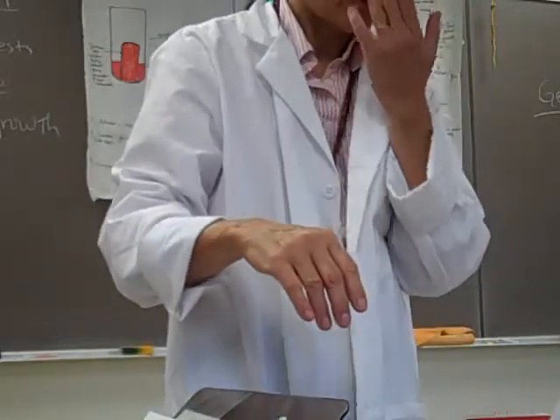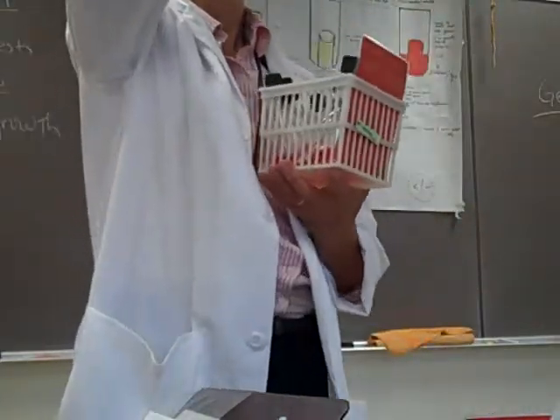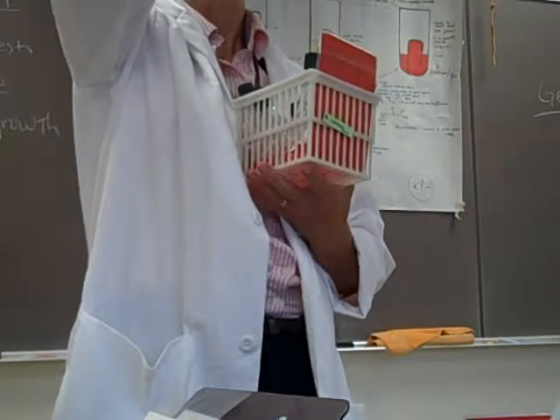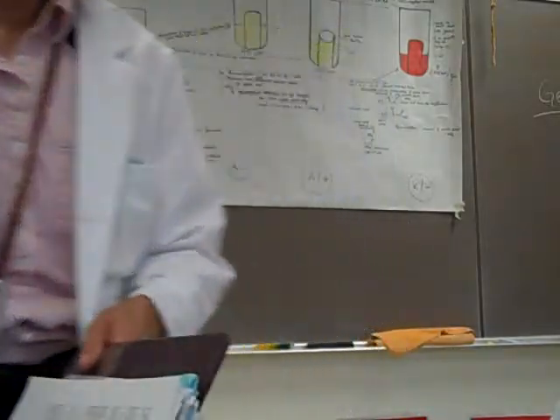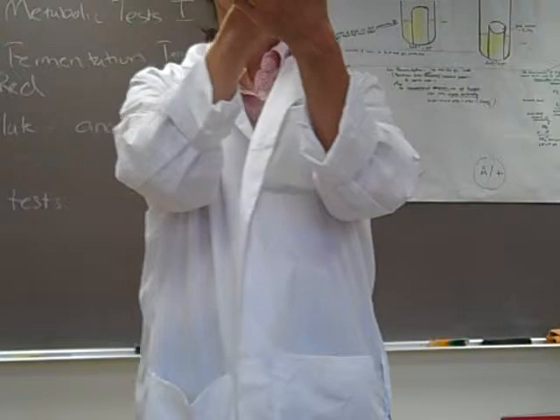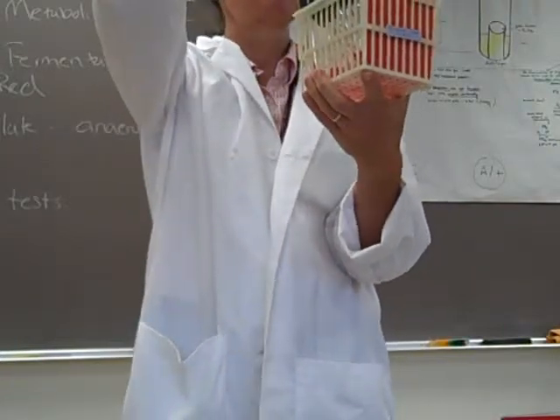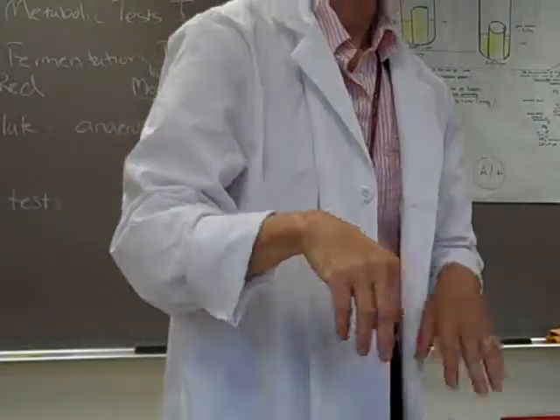Another type of PR fermentation media you'll inoculate is PR lactose. Which sugar is present in PR lactose? Lactose, good. You got the hang of it, huh? Okay, and the last one is PR sucrose. Okay, and so which sugar is present in PR sucrose? Sucrose, good. Okay, now just a quick chemical chapter 2 review, you guys.